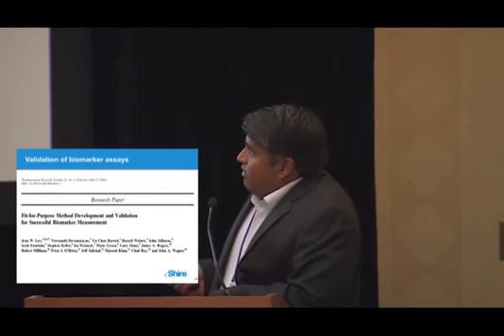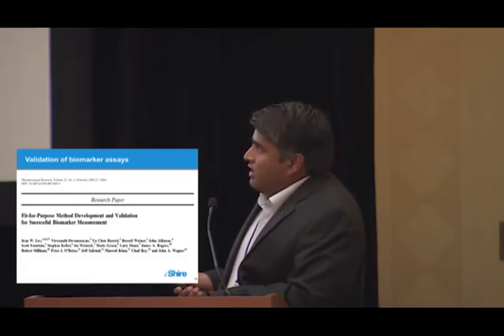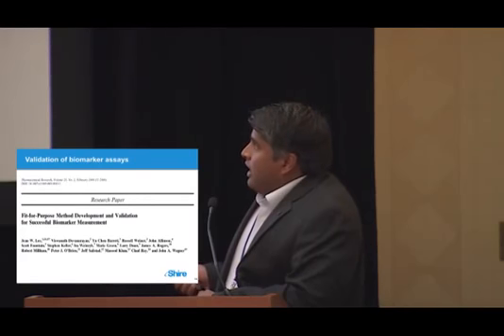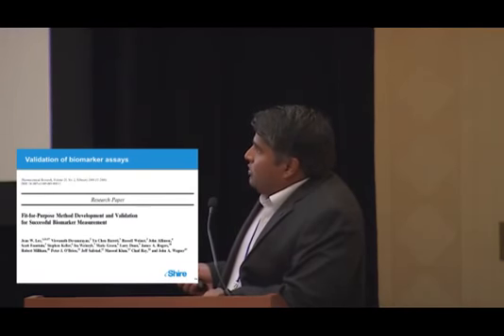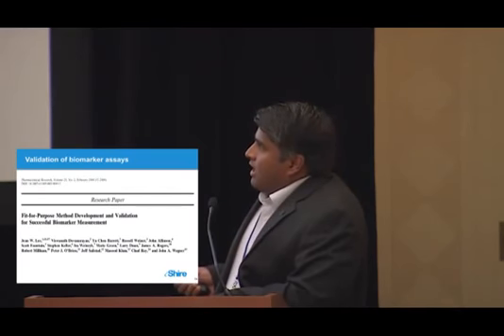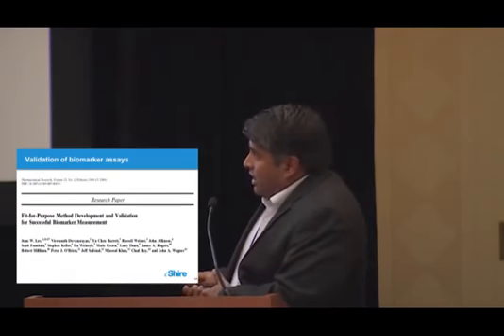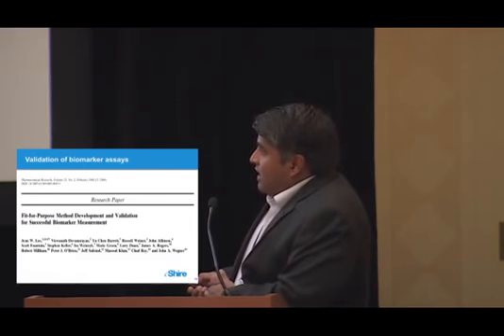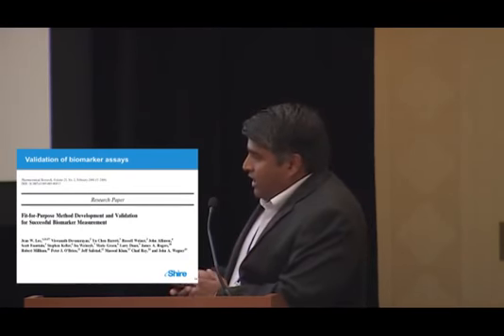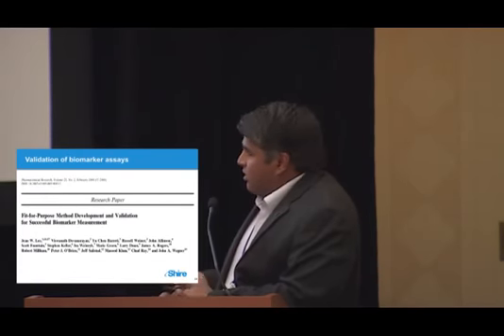Then we finalized with the capture antibody that is a mouse monoclonal and the detector antibody that is a goat polyclonal, from two different vendors. Interestingly, they were both immunized with a similar RANKL immunogen. And this pair should also detect all isoforms of RANKL. When we tested in ELISA, the approximate sensitivity was 5 picograms per ml. It is different from, if you remember, the DuoSet, where it was 78 picograms per ml.